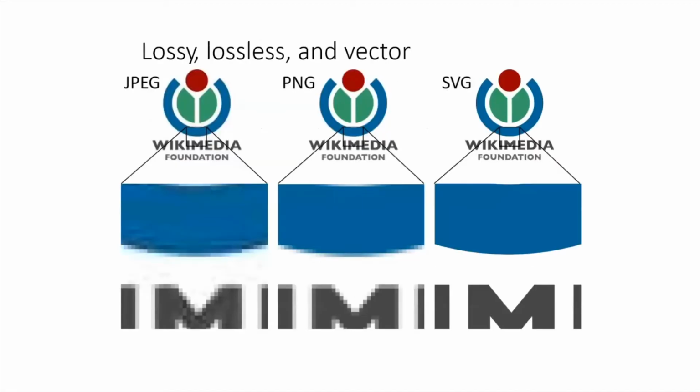And to show a difference between lossy, lossless, and vectorized image, here you have the same image in the 3 types with some zoom. And you see with the lossy that you can see the artifacts of JPEG compression around your image. So if we had to do some image analysis here, the computer would find these artifacts and would maybe make false positives or problems around these. So that's why we always want to use lossless compression when we use it as input for our algorithms. And then the SVG, of course, has no pixel visible at all because it's only the shape that is defined.